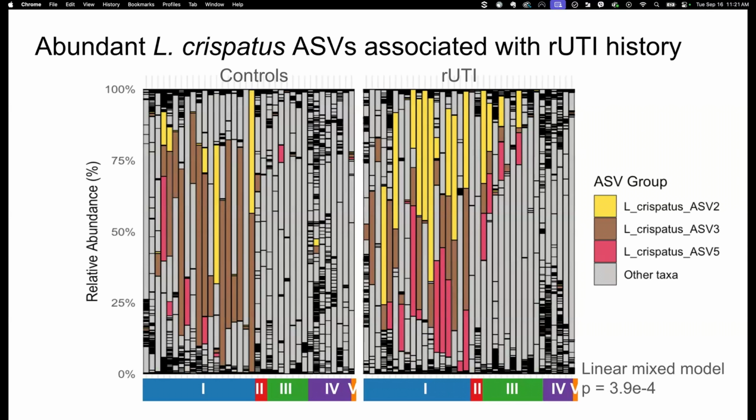And it turns out when you look at it this way, there are, in fact, a couple of Lactobacillus crispatus ASVs that seem to typify one group versus the other. So this ASV2, and to a lesser extent ASV5, seem to be enriched in our rUTI group as compared to our controls, which tend to have a bit more of this ASV3. And that was pretty cool. Of course, we immediately want to go to the next level of asking, do ASV2 and 5 matter? And if so, how? But it's a little limiting to just take the ASVs at face value.